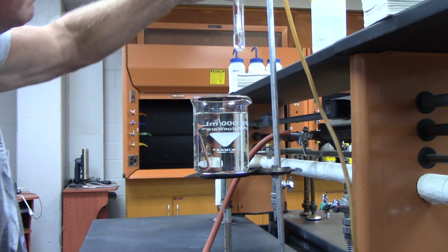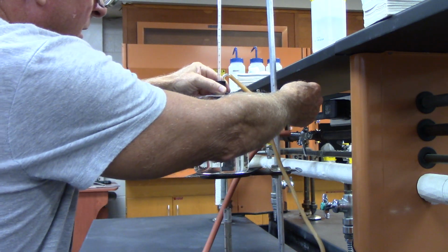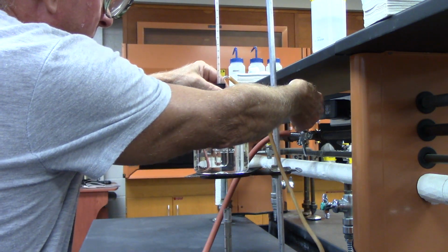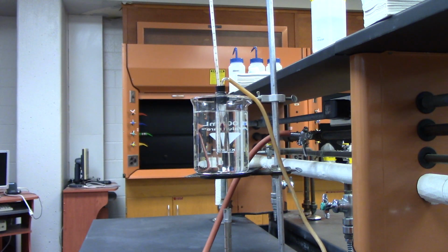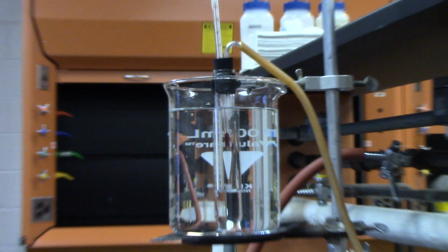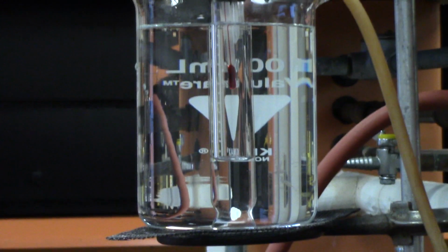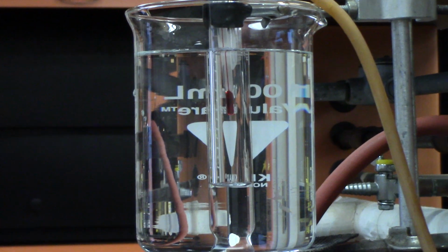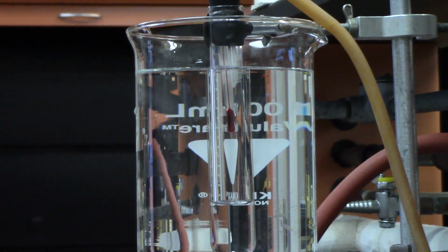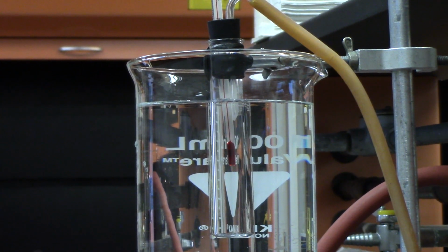Okay, and what I want to do is set the test tube and the liquid, the unknown, with the unknown in the water. Now, if you take a look here, you can see that the unknown liquid and the thermometer, red bulb of the thermometer, are both under the surface. They're both submerged under the level of the water, and that's important here. Okay.